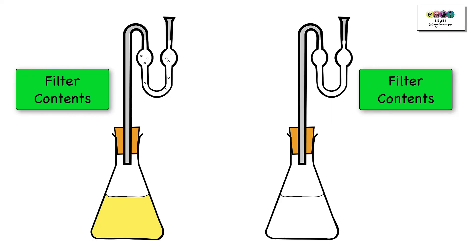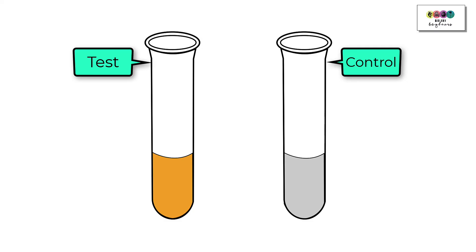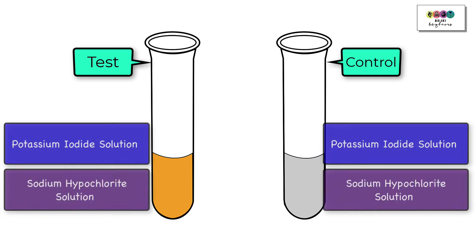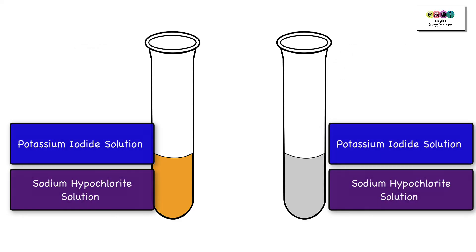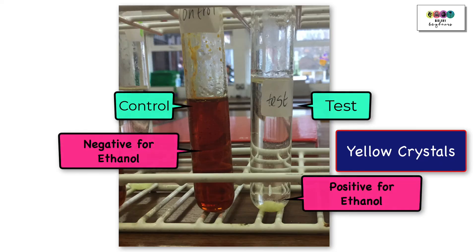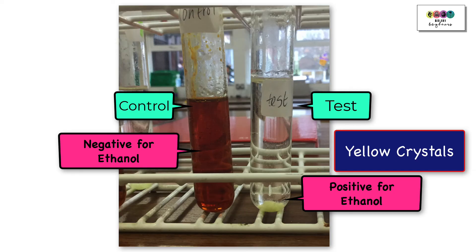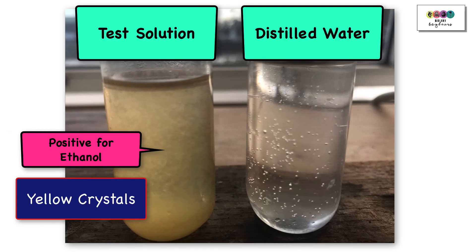After 24 hours, remove from the water bath or incubator and filter. Add some of the test filtrate into one test tube and some of the control filtrate into another. To test for alcohol, add some potassium iodide solution and sodium hypochlorite solution to both test tubes, then warm gently for four to five minutes. After cooling, the test tube on the right shows yellow crystals — a positive result for ethanol — whereas the control stays a browny-orange colour. Tested against distilled water, the test solution again gives a positive result: yellow crystals.